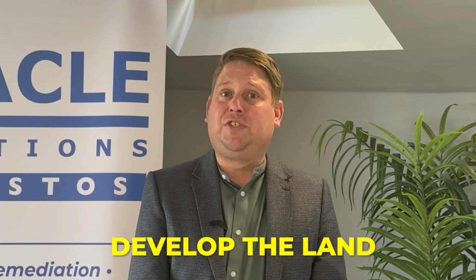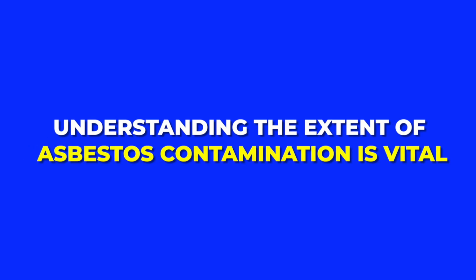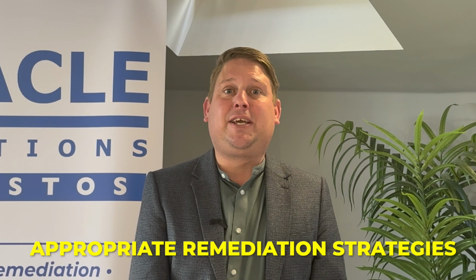Each stage of lab testing is critical to providing accurate data that will inform how to manage the land safely, whether the goal is to develop the land or mitigate environmental and health risks. Understanding the extent of asbestos contamination is vital. Understanding the various types of asbestos and their potential health risks is an essential part of the soil sampling process. By knowing which type of asbestos is present, professionals can better assess the risk and recommend appropriate remediation strategies.